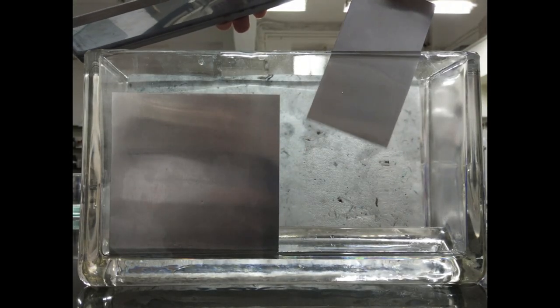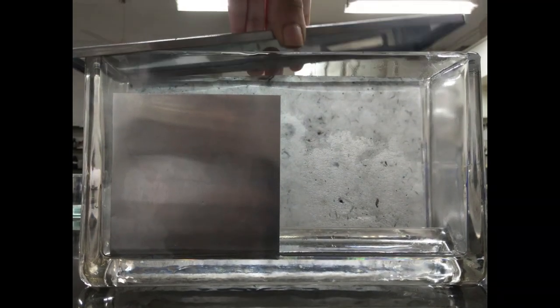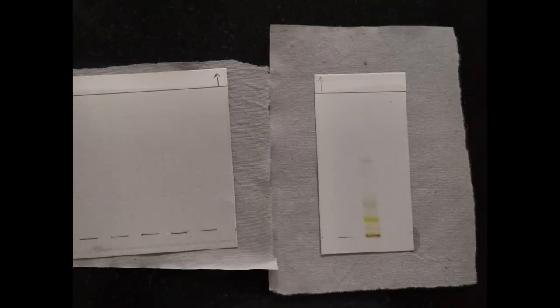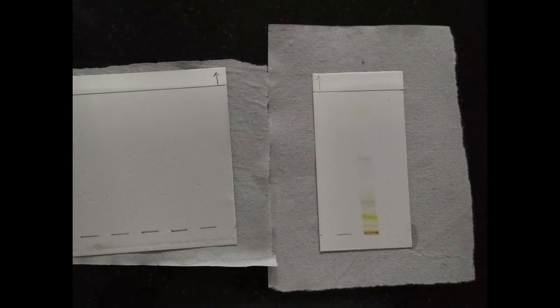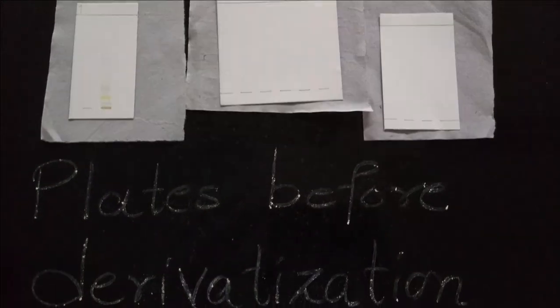After plate development, why aren't the bands visible? The bands aren't visible because there are few colorless compounds present in our sample. Hence, we use derivatizing agent.